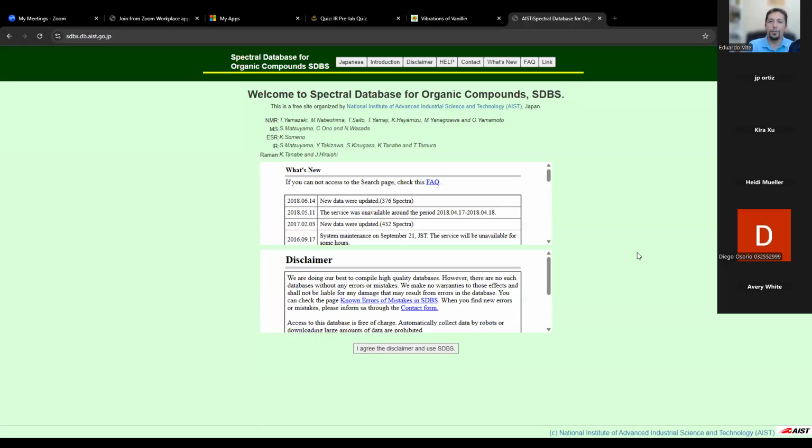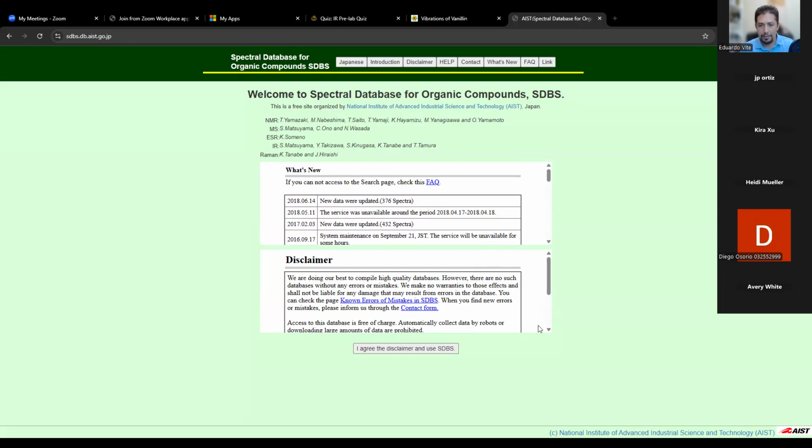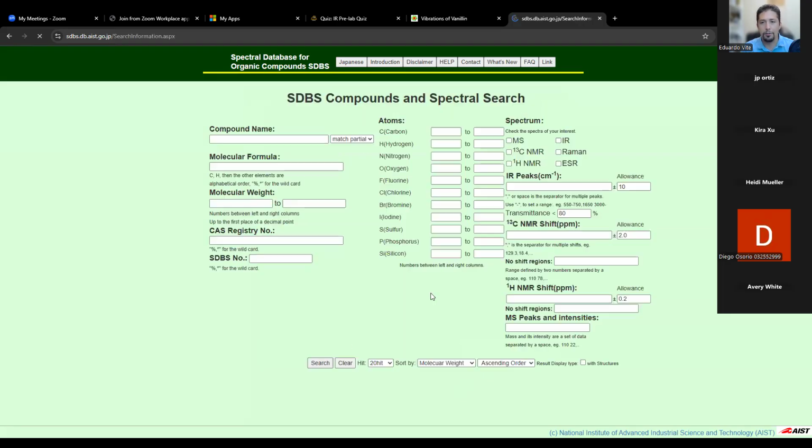Alrighty. Well, for practice, since the book doesn't really have a lot, and you guys kind of have to go through module 4 on your own, I recommend you go to this website. It is the Spectral Database for Organic Compounds, SDBS. It's a highly kept secret unless you take like the real OChem. And even people who take real OChem never learn about this until they're in grad school. So my professor was able to teach me about this a long time ago. You go ahead and click the disclaimer. You can look up any compound and get the IR spectra.